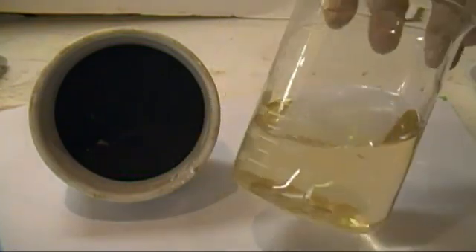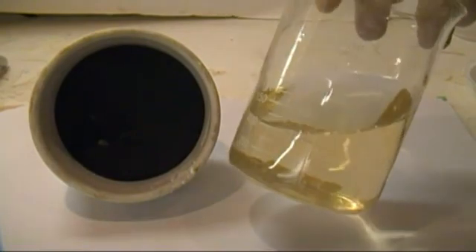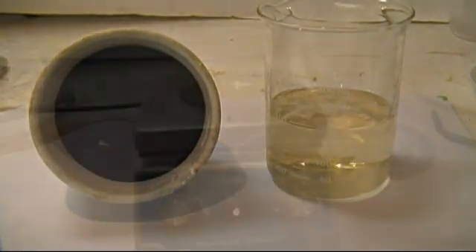It has a very slight yellow color, which is probably because I didn't add enough carbon or let it agitate long enough. However, it is fine since this is for demonstration purposes only.